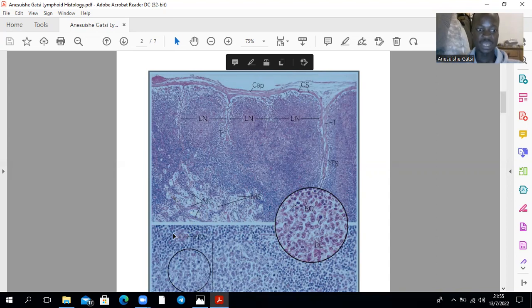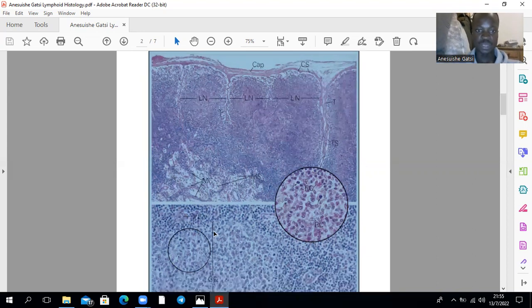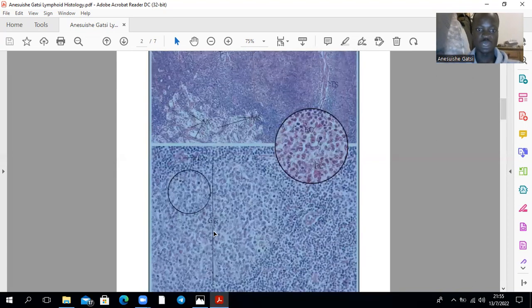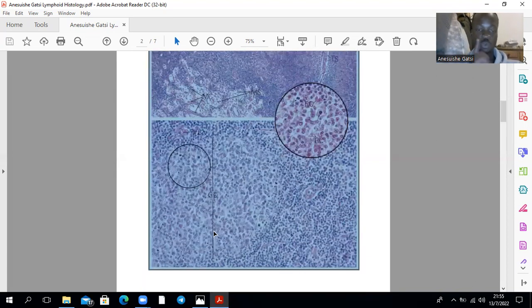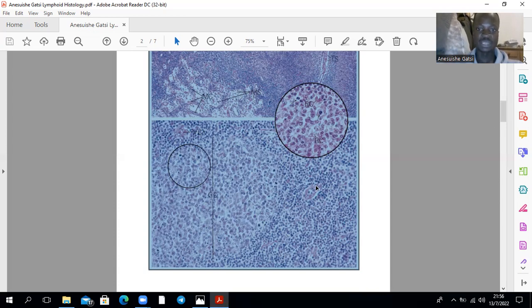That's a high endothelial venule — quite characteristic within the lymph nodes. This here is showing a lymphoid nodule. This is the outer region — that's the coronal layer, the mantle layer — and the center right there is the germinal center. That's another high endothelial venule.